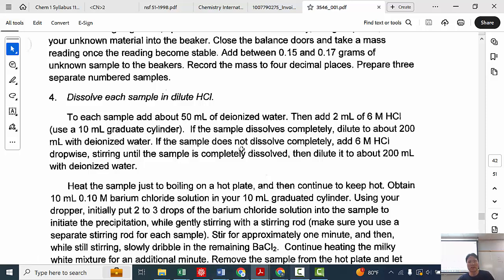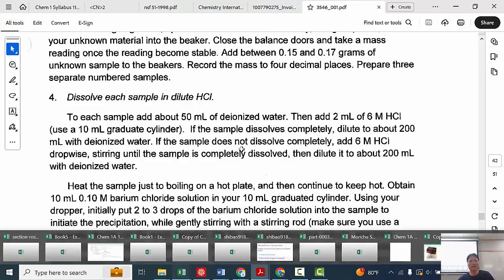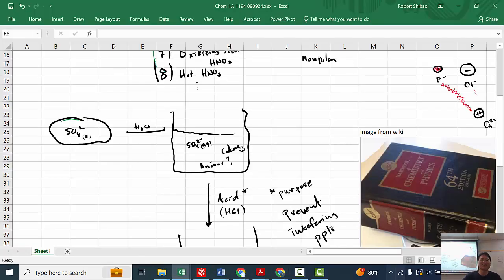I go through the procedure and then just on my drawing, this is what I have in my lab notebook, is something like this. Somebody told me 0.3 to 0.4. Double check this. I think there are two different instructions. Yeah, two different ones. We're on the second set. Is the second set 0.3 to 0.4? Yeah. Okay, then I'm wrong here. If I make a mistake, I just do this.